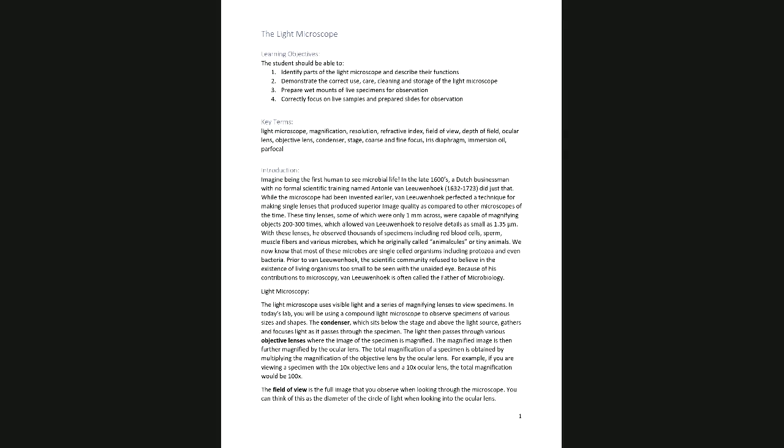But today we're going to talk about microscopy and how to use a microscope. Next week we'll talk about staining in lab. So I'm going to go through this like I would normally discuss it in class, and then we'll watch a video that does a pretty good job of talking about almost everything I would do when I would show you an actual microscope.